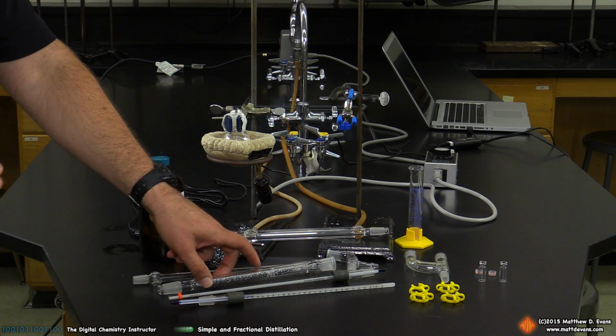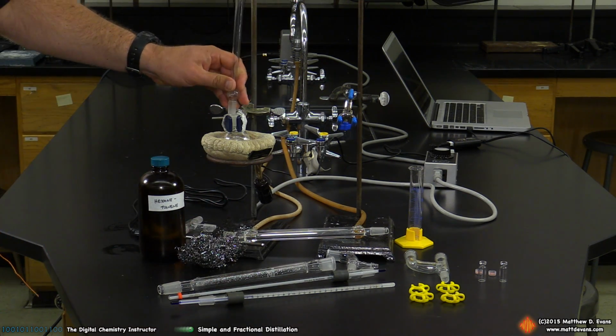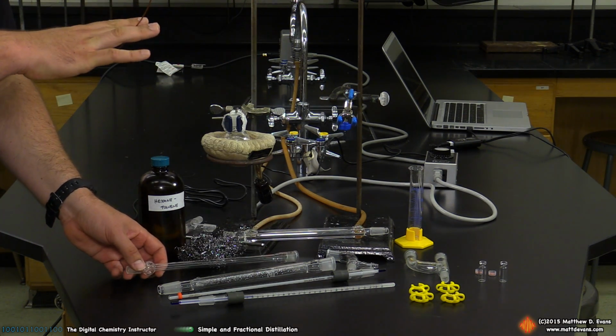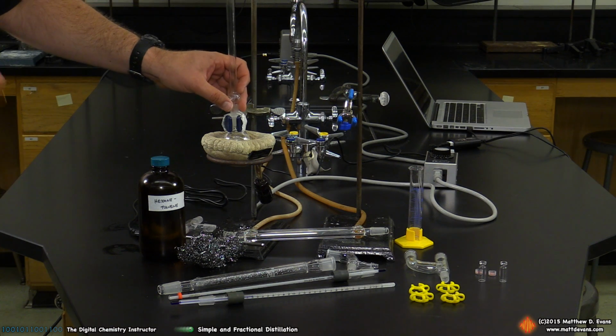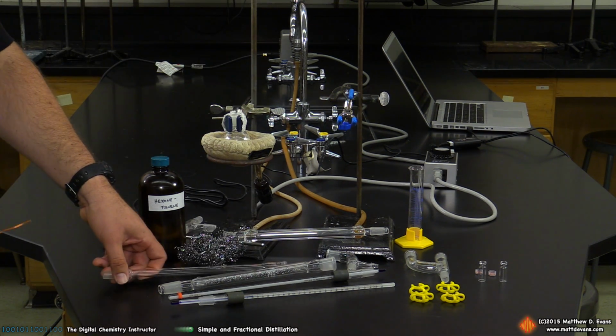The only difference between simple distillation and fractional is the addition of this little piece. It's also probably going to require that your entire setup be a little bit higher up before you get started, because this column is really tall, as you can see. So the whole thing ends up being a little bit higher. But let's go ahead and set up for simple distillation.